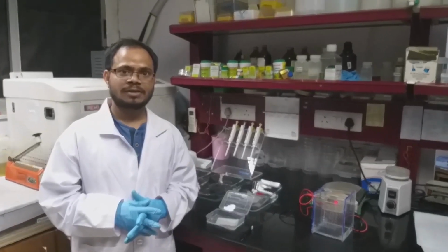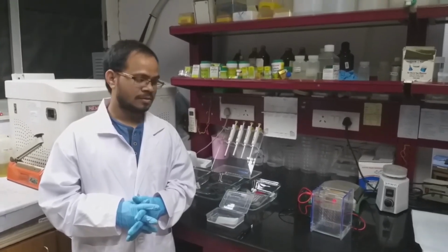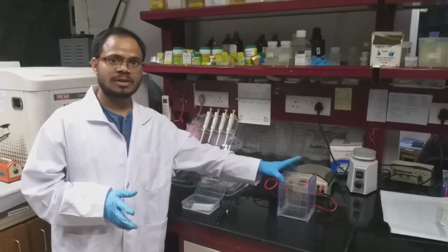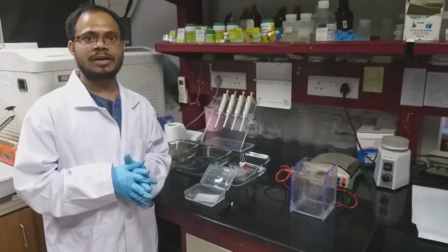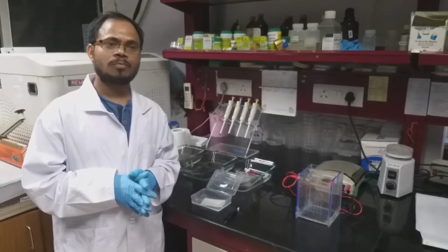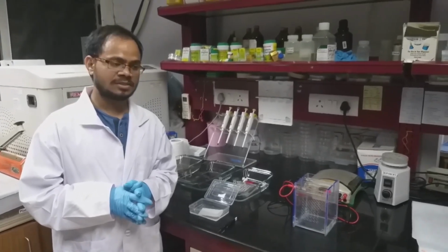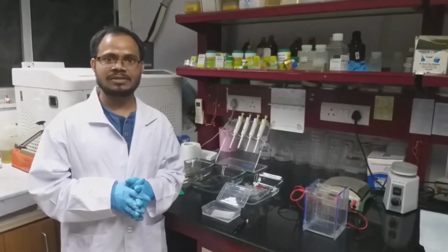For doing Western blot, we need membrane, transfer buffer and the transfer medium. This one is what we use to transfer the gel to the membrane. Here the membrane can be of two kinds. One is nitrocellulose, which has low protein binding efficiency and is hydrophilic in nature. Another membrane is PVDF. This is a hydrophobic membrane with higher protein binding capacity.